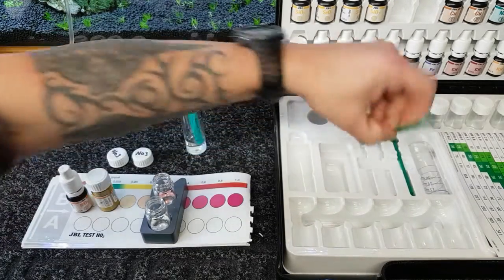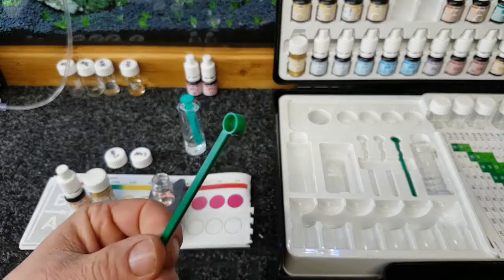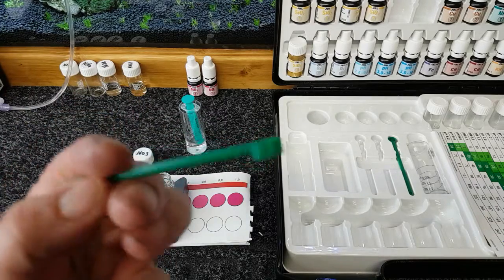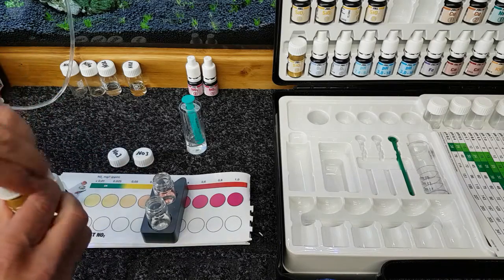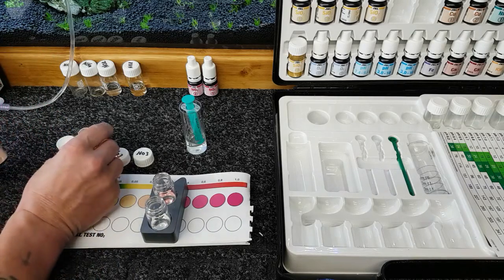Now we need one of these little spoons. I've got loads of these spoons kicking around, and there was one missing out of the test kit, which you're going to get, but I've put one of these back in instead, so you've now got 3, because I've got some more lying around somewhere. Now we've got to take the top of this powder off, being careful not to throw it all over the place.